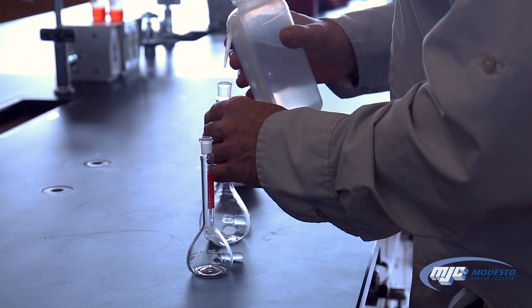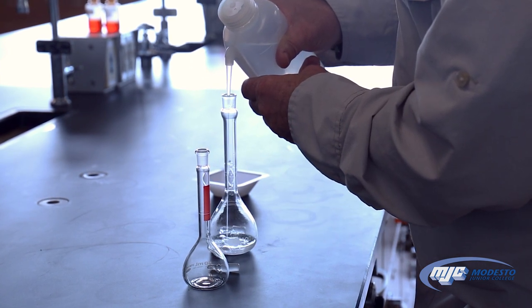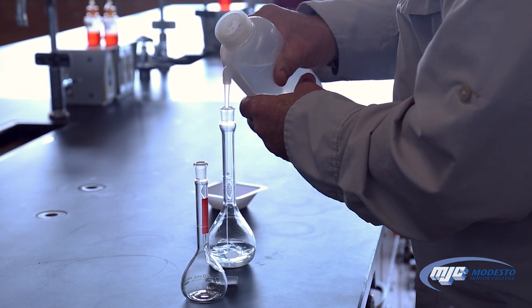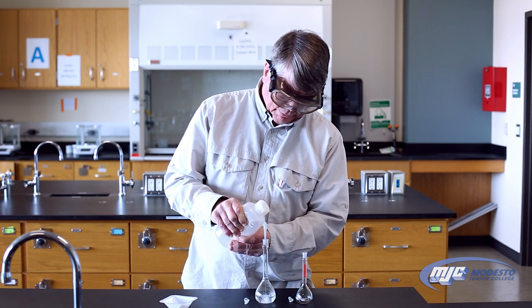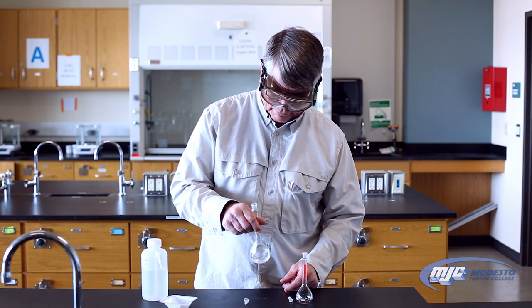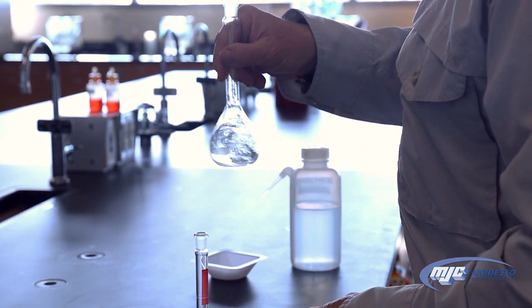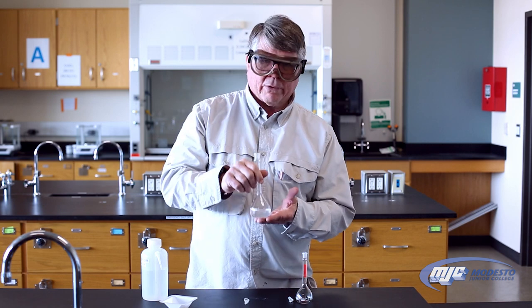The way to use these is: first add enough deionized water so that the flask is maybe about half full or so. Then make sure you get your compound to dissolve, or if it's a solution, get it mixed up. So let's see if that will dissolve. I got all the solid to dissolve.